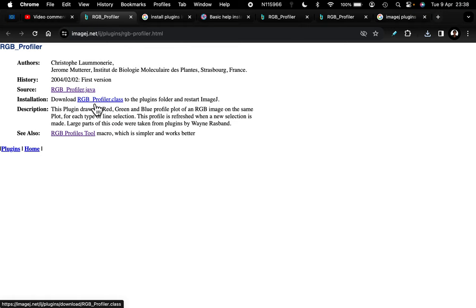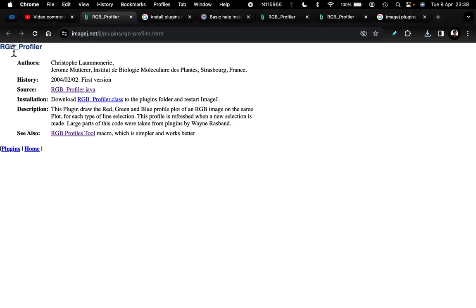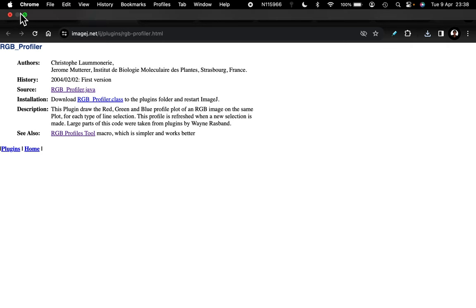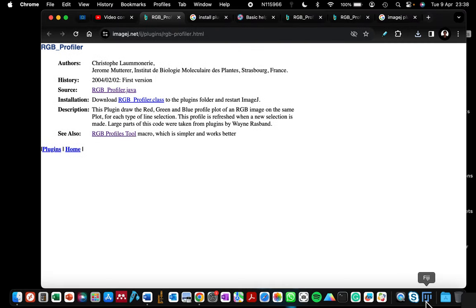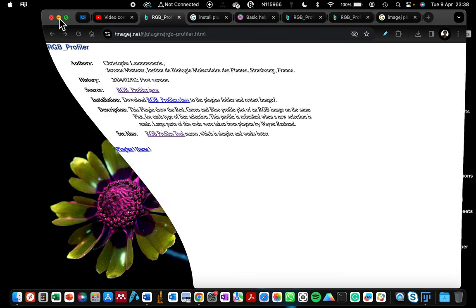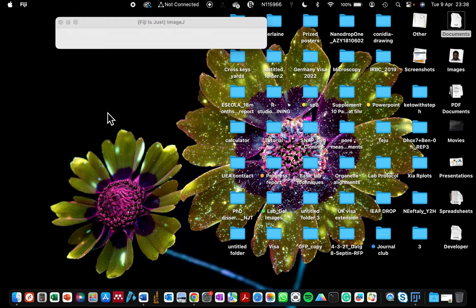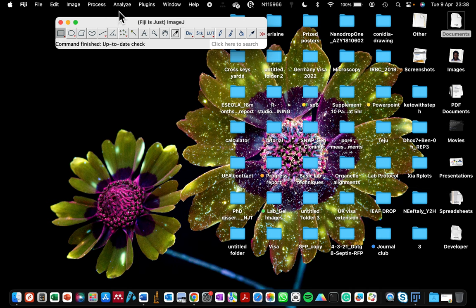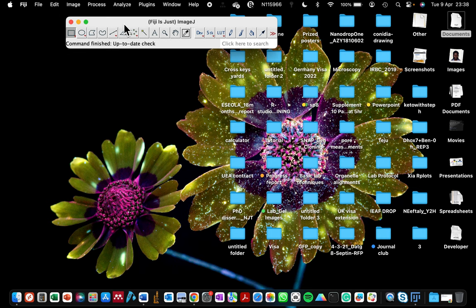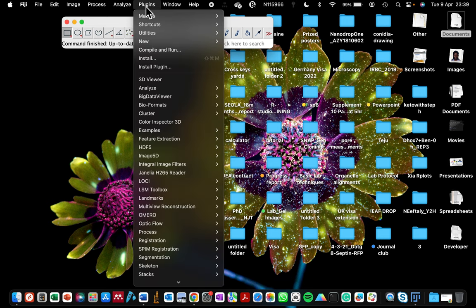Now I'm going to open my Fiji and then I will show you where you need to click so that you can do your installation. My Fiji, which is just ImageJ, has been opened. You're going to go to the section that says plugin. I'm currently recording from a MacBook - it's similar procedure if you're using a Windows PC. Click on that plugin.